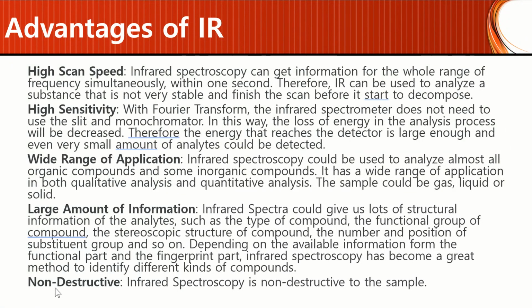And then finally, it's non-destructive. IR spectroscopy is non-destructive to the sample, and that is very important. Even me as a natural products chemist, when you have milligram quantities, very small quantities, and you want to get the data, you can get the data and use the sample for other spectroscopic methods. So all of these advantages are important, but this one is very important.